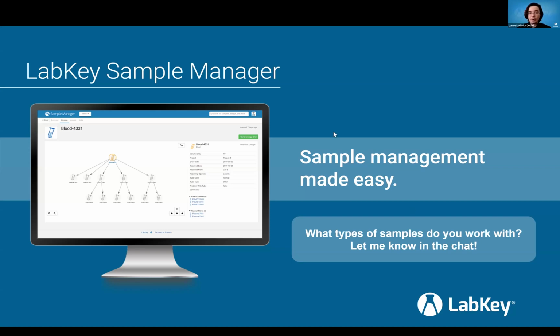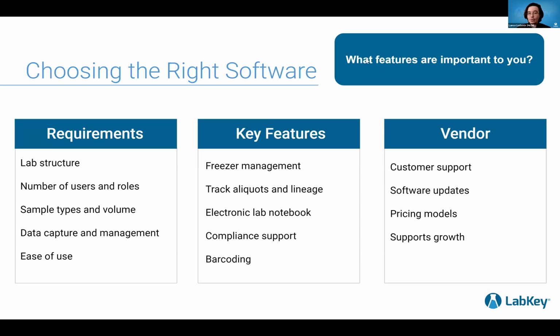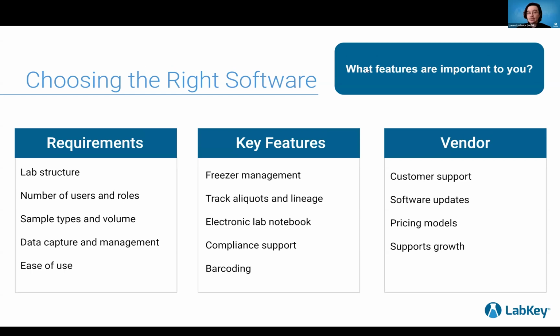So from here, we'll probably discuss a little bit about all of these different features, but I want to know what's important to you when evaluating a new system. So we have a poll that's going to launch. We just want to know what features you are looking forward to in Sample Manager. It's multiple choice, so feel free to select as many as you want. We can look at sample tracking, freezer management, workflow, assay management, and electronic lab notebook. I'll keep this up until we start the demo so we can get more of a response.